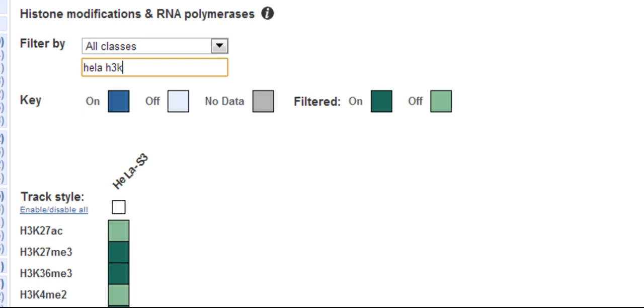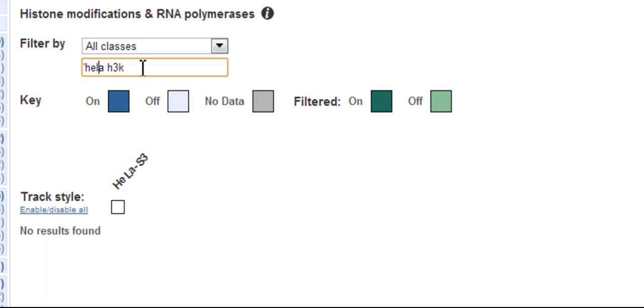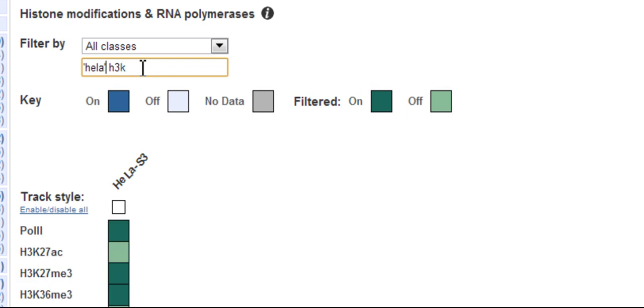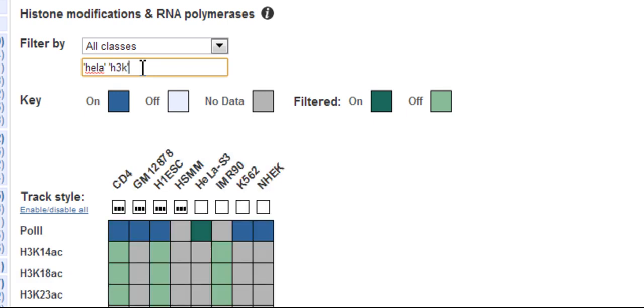However, if you use quotes, either single or double in the search, I'll put quotes around HeLa and quotes around H3K, you get cells which match either of the search terms.